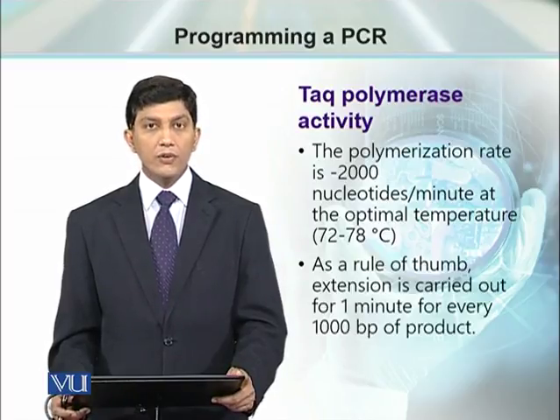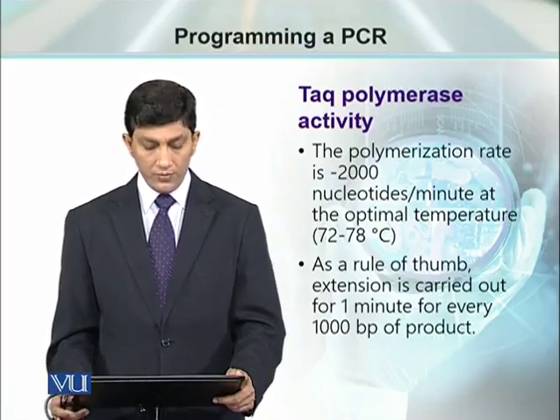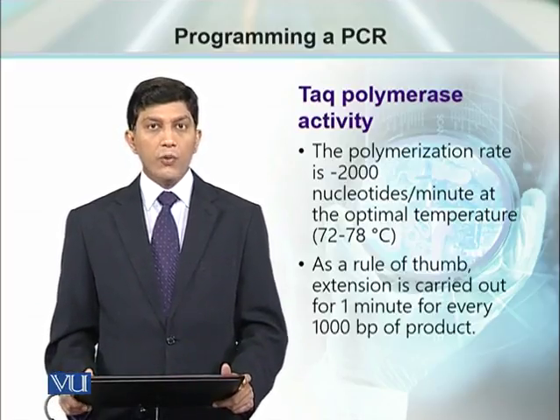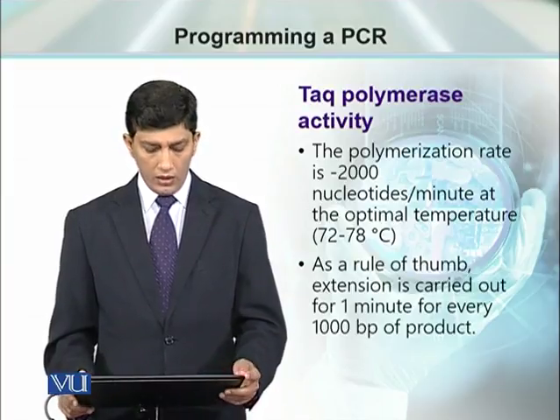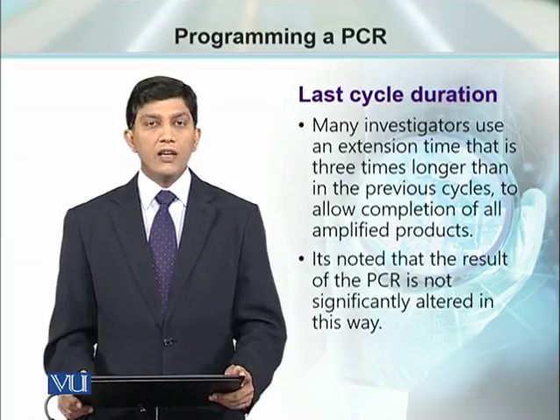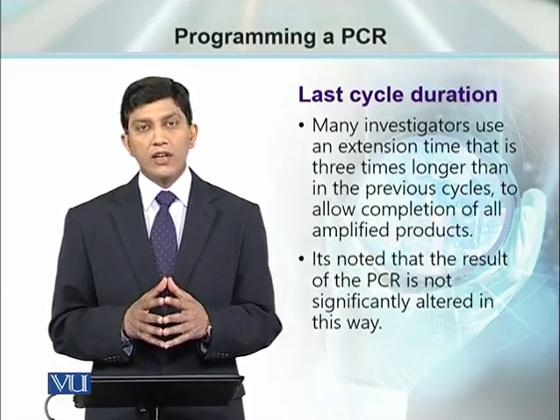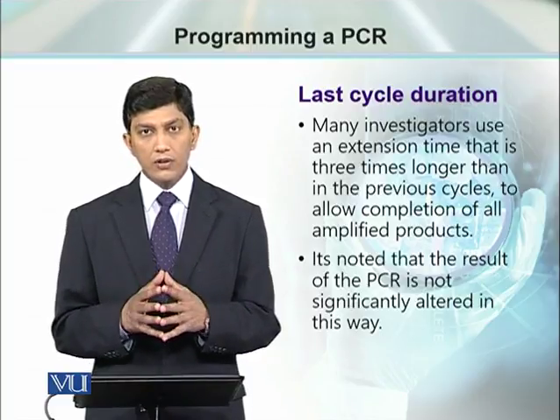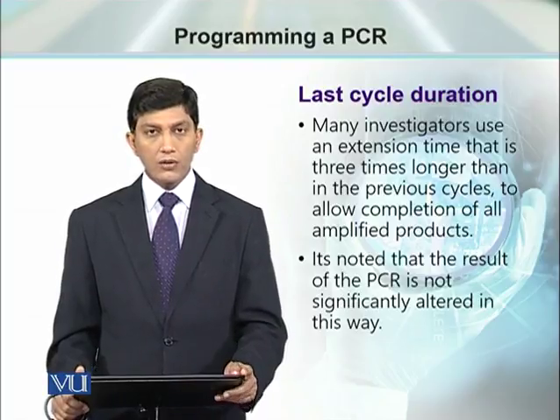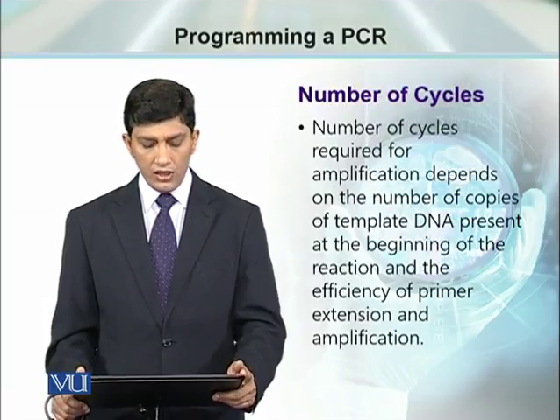The polymerization rate of nucleotides is 2000 nucleotides per minute under these conditions at this temperature. As a thumb rule, we should carry out the extension for 1 minute for every 1000 base pair product. In some labs, the last cycle is extended, and the idea is to maximize the extension of the DNA strand from reading the template strand. But overall it has been seen that it is not going to make any significant change in the results.